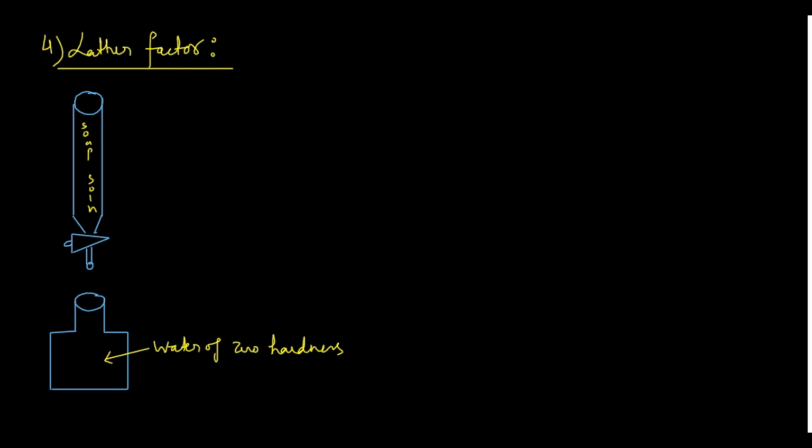For this lather factor, again I will take the soap solution in the burette, and here I will take water of zero hardness, that means distilled water. Water of zero hardness means distilled water.